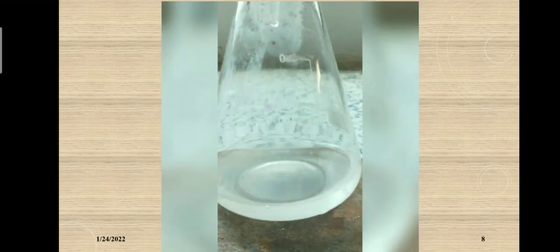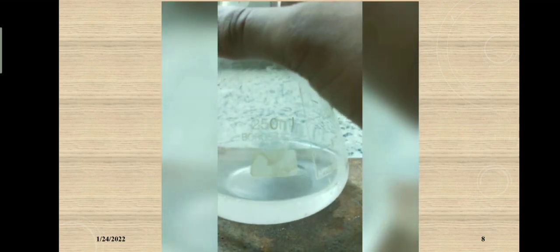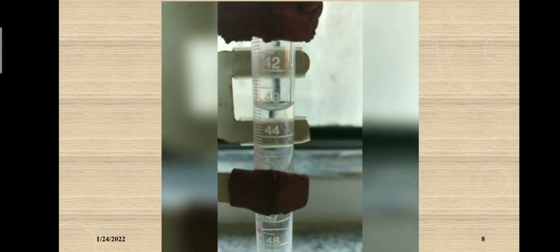That is the intermediate stage, when the color forms but does not yet persist throughout the solution. After a certain time comes the end point: you can see that the colorless solution turns pink after addition of 3 to 4 drops. The solution color persists, a light pink or violet-pink color. The volume of the NaOH solution is now 43.1.